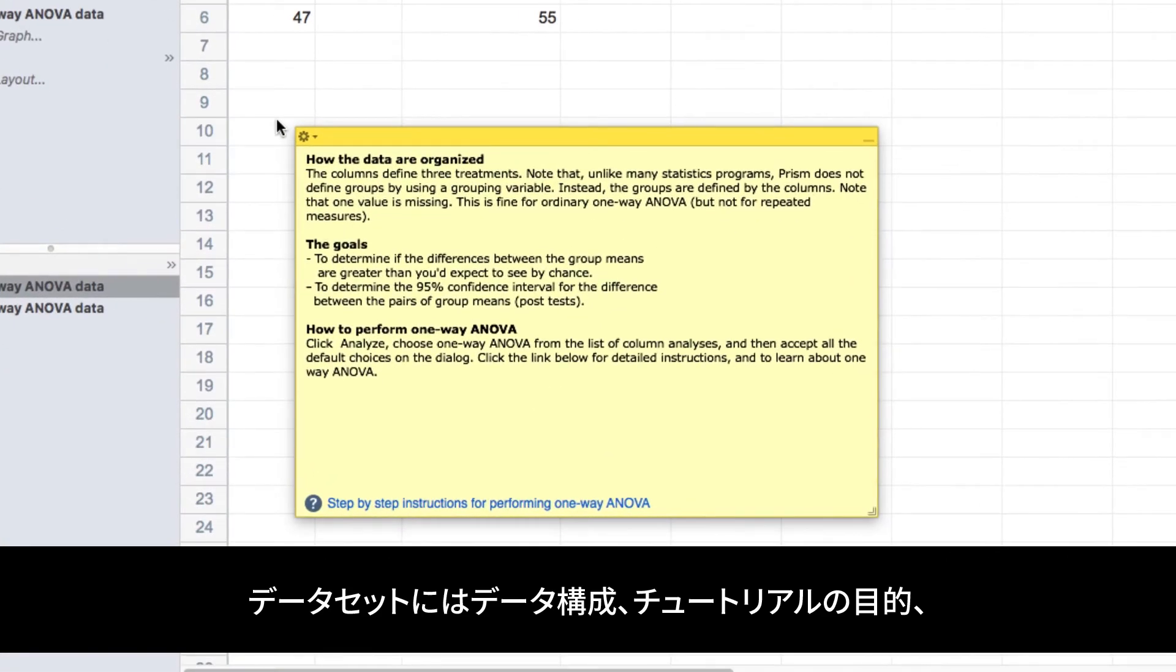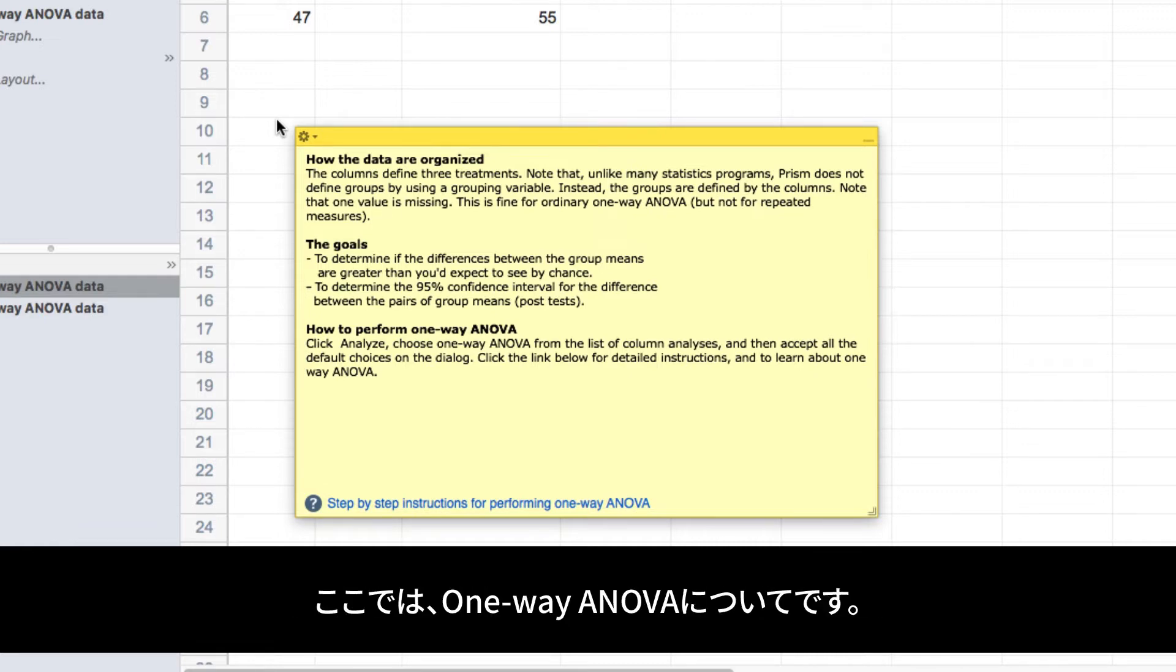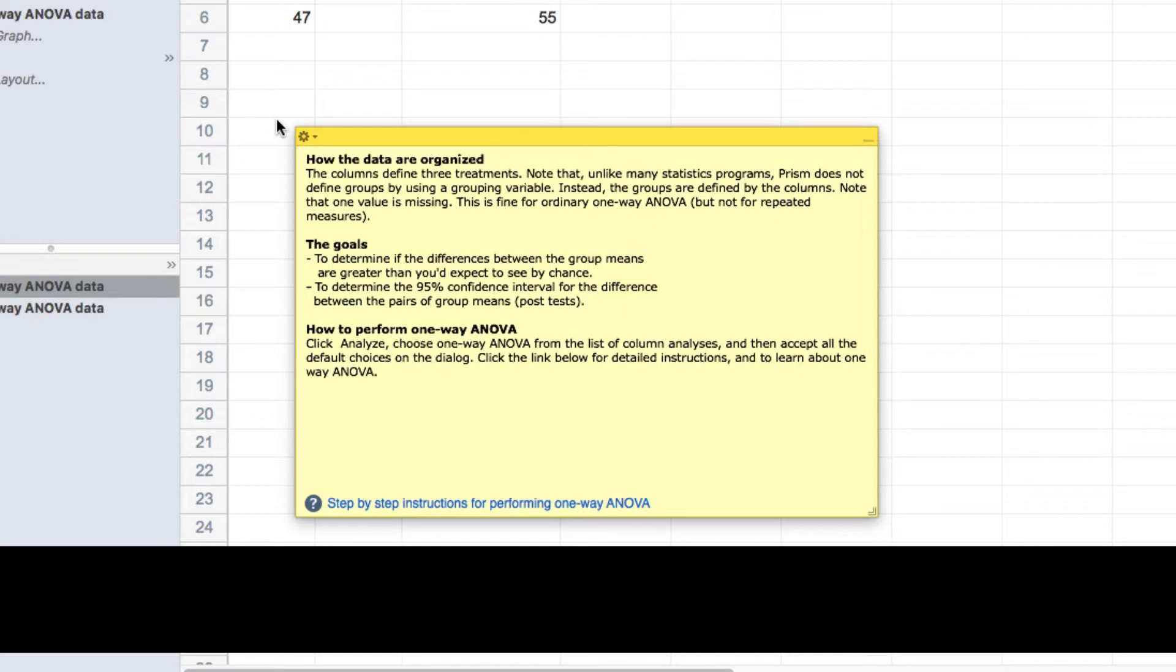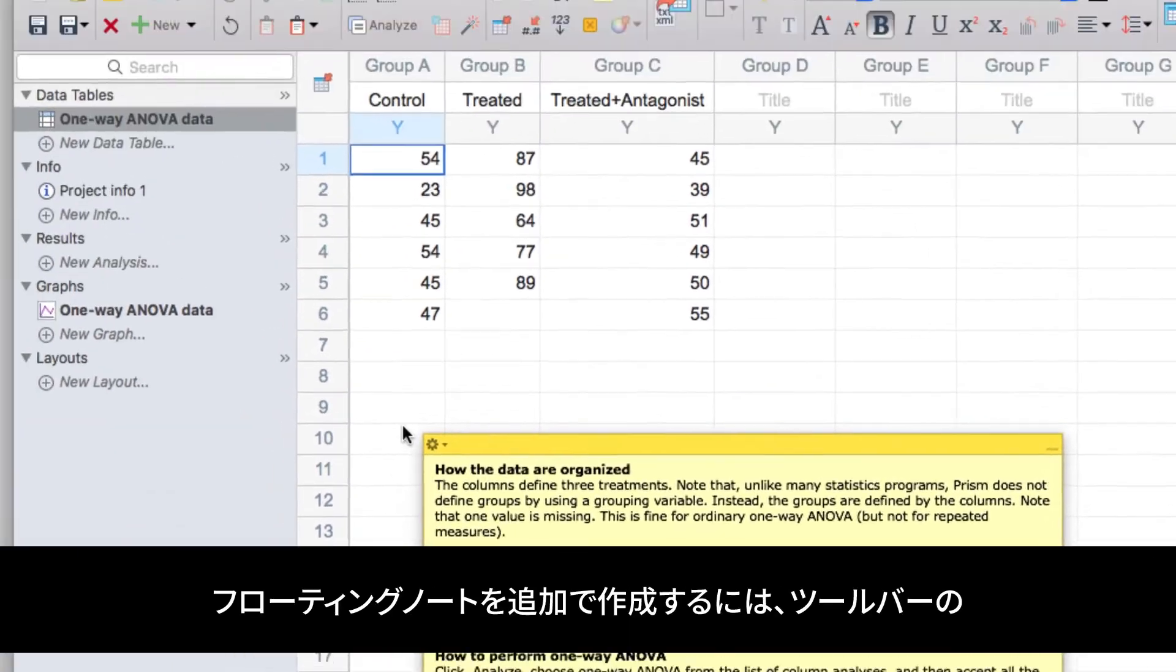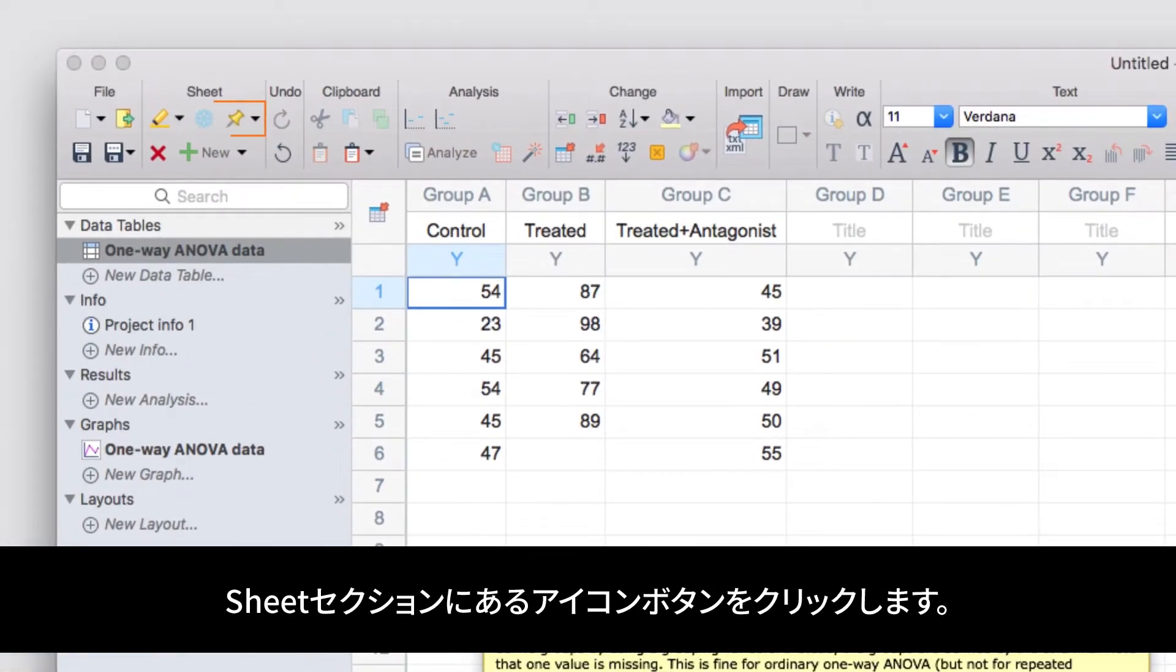These data sets will also provide instructions that cover the basic structure of how the data are organized, the goals of the tutorial, and some brief instructions for how to achieve those goals, which are typically to perform the analysis of interest, in this case, a one-way ANOVA. These instructions are shown on a floating note on the data sheet, and you can add your own floating notes by clicking on the floating notes button in the sheet section of the toolbar.